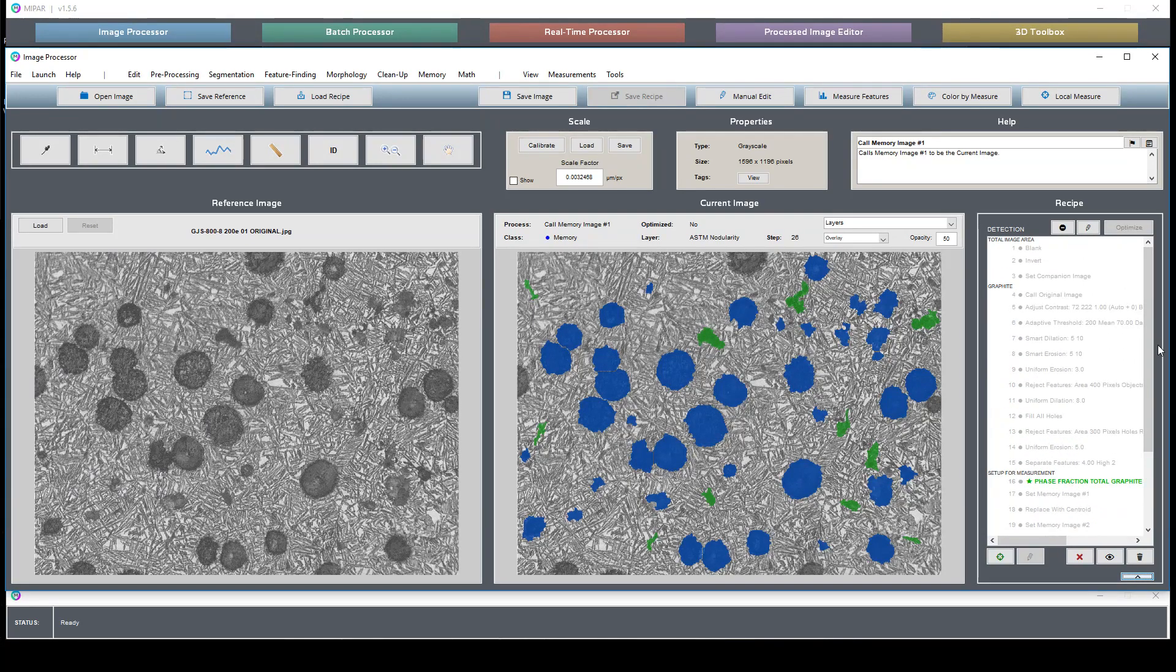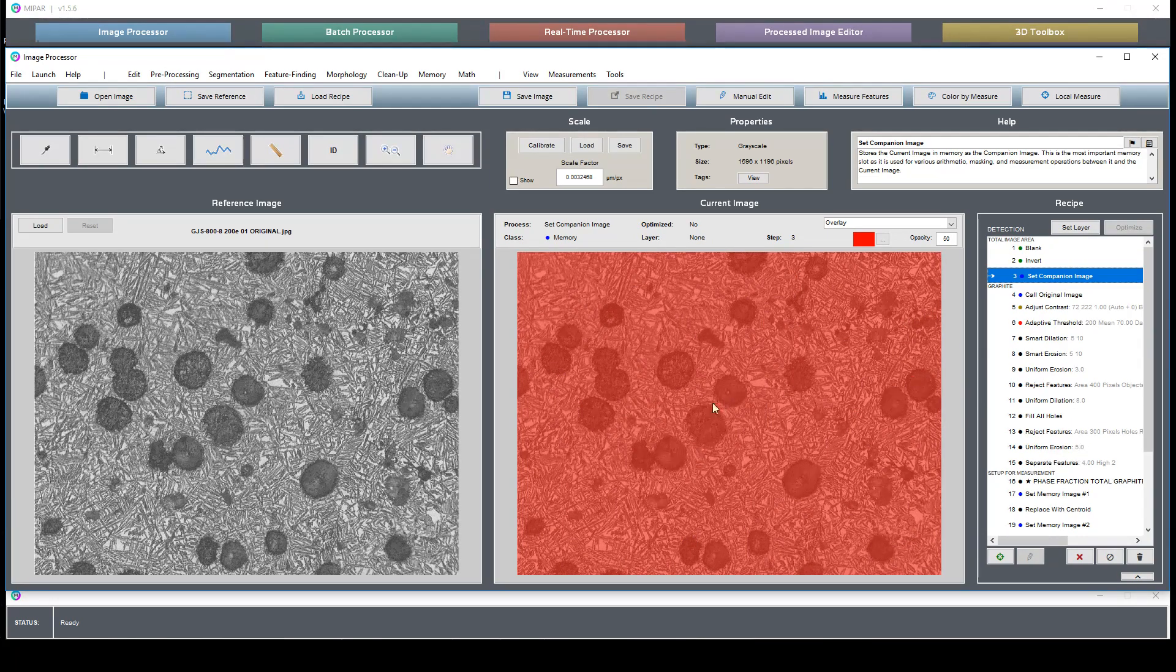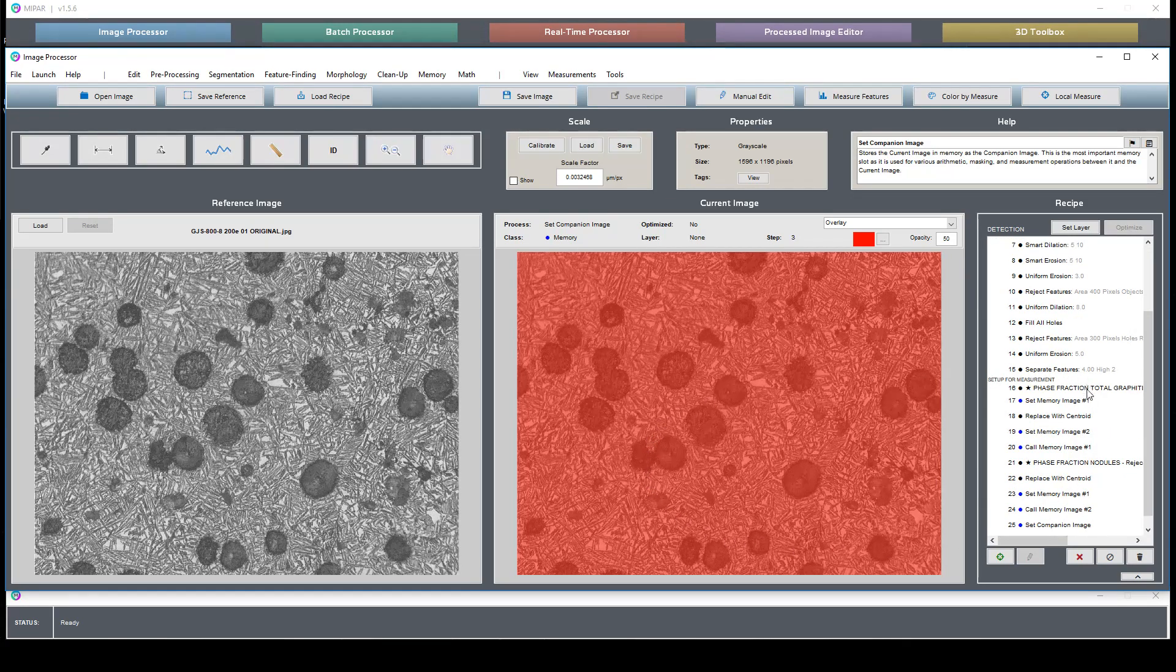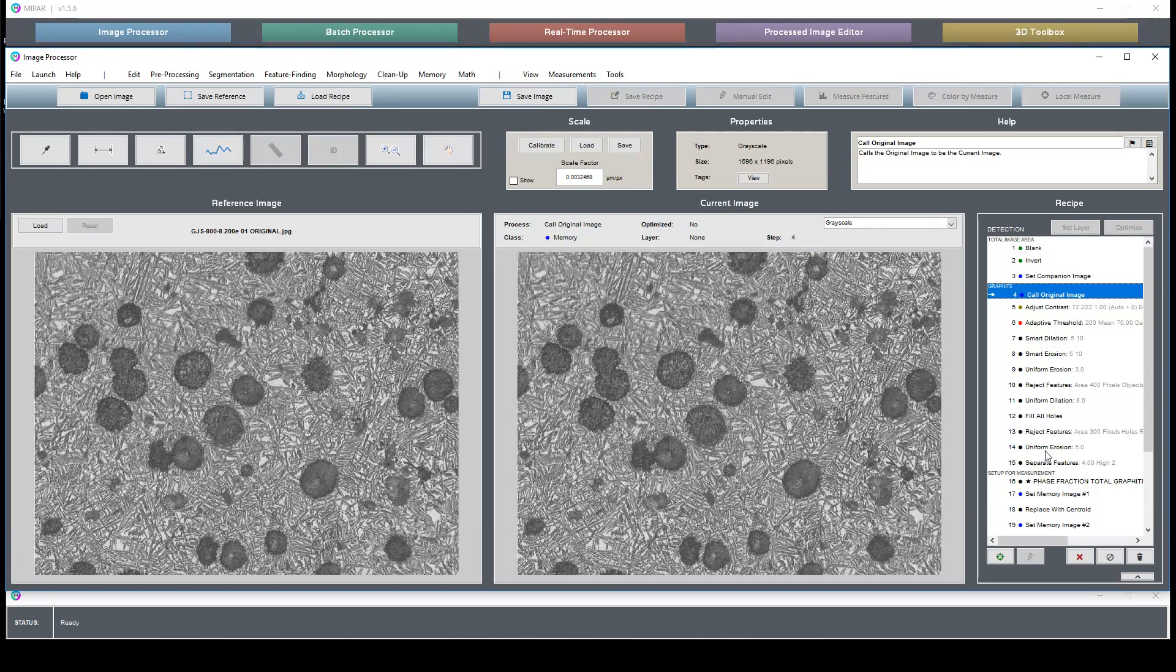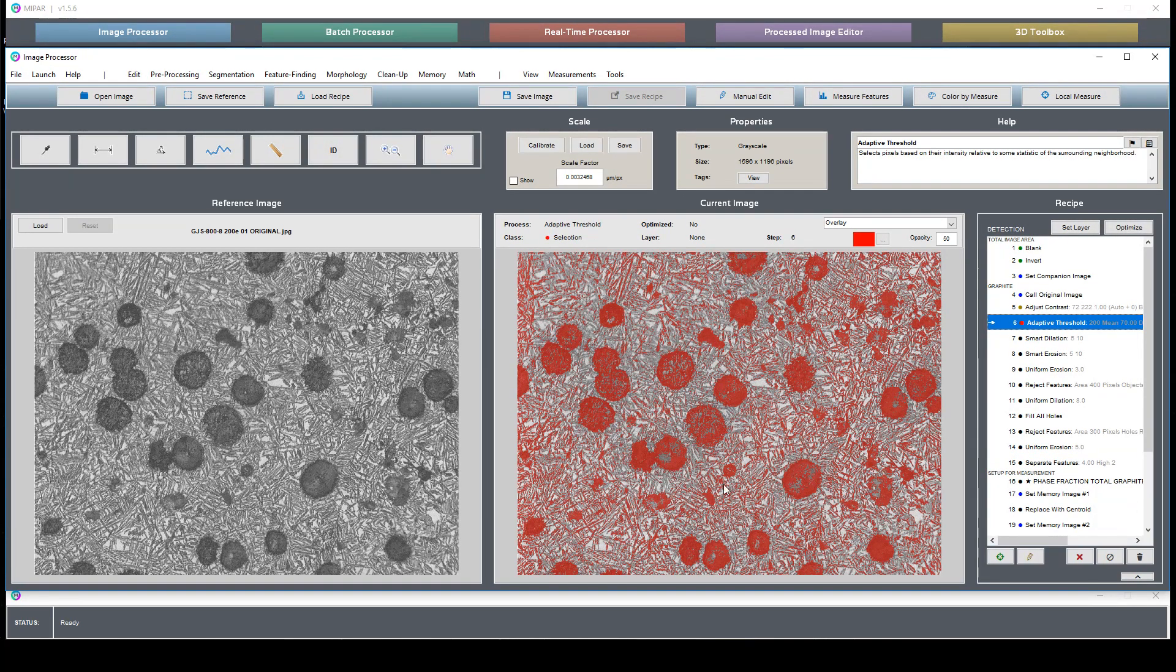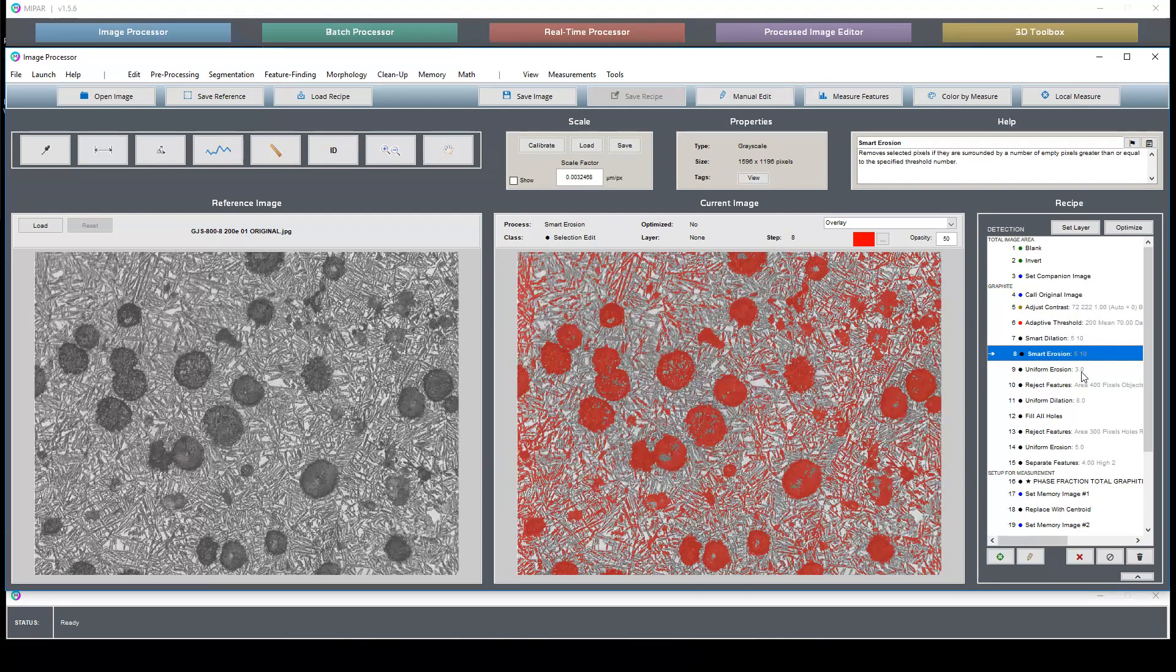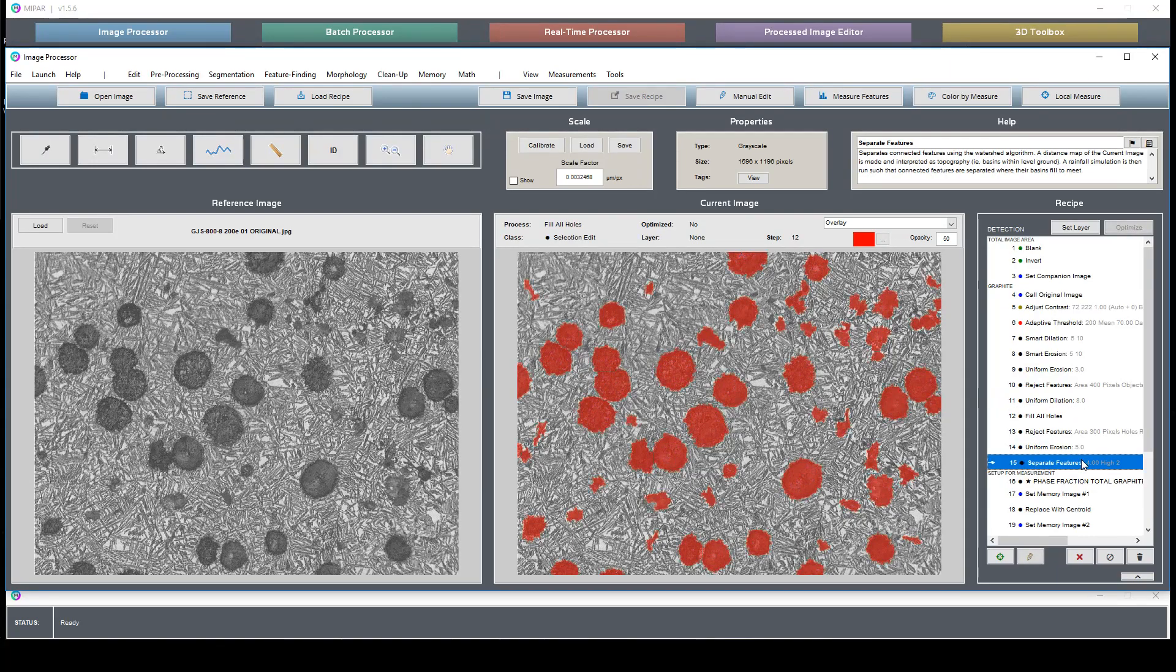So the recipe is a pretty simple recipe and all I'm doing here is setting up some companion images for the total area. This is simply used to do the measurement for the phase fraction. This graphite chapter goes in and selects the graphite particles by selecting all darker features in the image, doing some clever dilation, erosion, and feature cleanup to result in an accurate selection.